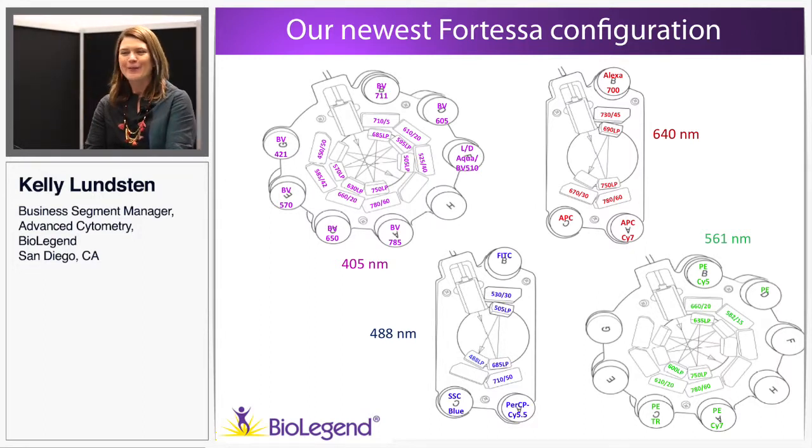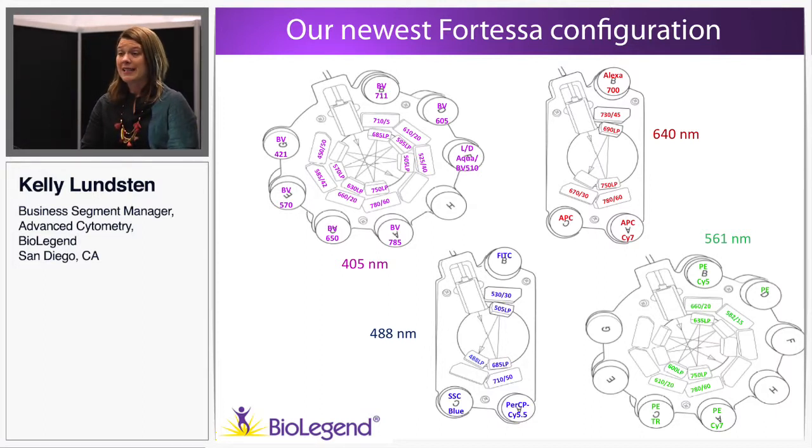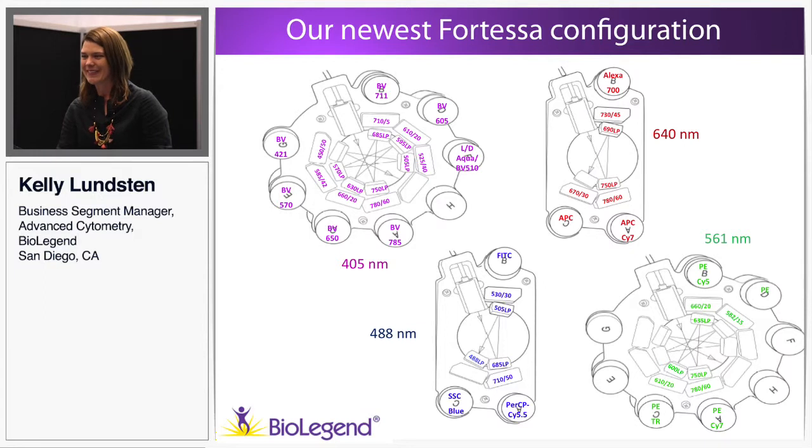instrument. I don't know if anyone saw on the Purdue listserv, does anybody pay attention to the flow cytometry listserv? Mario Roeder just put out an announcement that Prateep is going to give a talk at Cyto where he just broke, I want to say, the 30 color barrier on a Fortessa. So how much fun is that? It opens up a lot of potential for all of us.